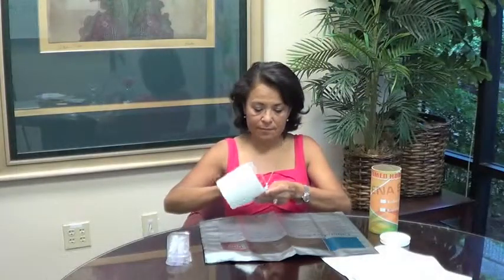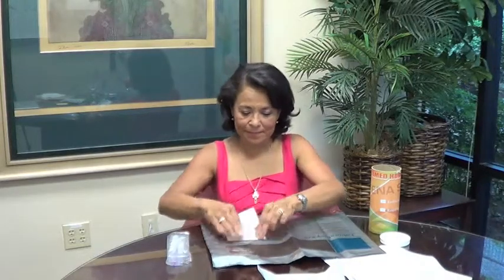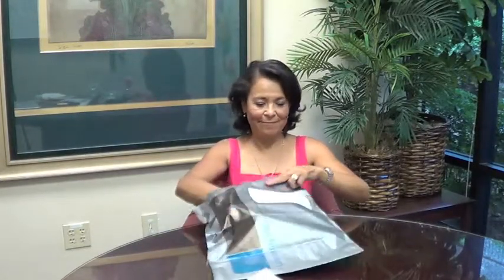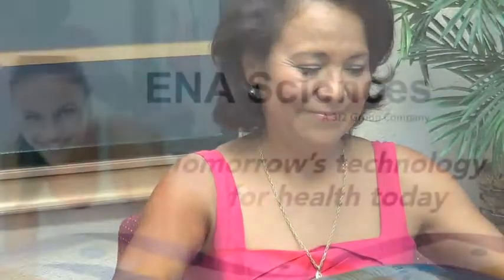Remove the samples from the freezer when you are ready to send off your ENA Sciences test kit. Attach the enclosed prepaid UPS shipping label to the envelope. Place the fully completed request slip and questionnaire along with the two saliva collection tubes into the ENA Sciences cardboard canister. Place the ENA Sciences cardboard canister inside the UPS laboratory pack envelope. You are now ready to mail off your ENA Sciences at-home testing kit and receive your very own state-of-the-art personalized treatment protocol.